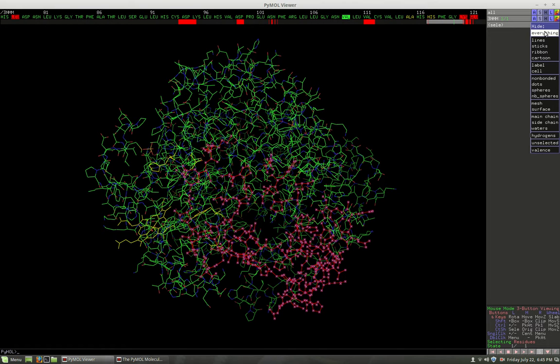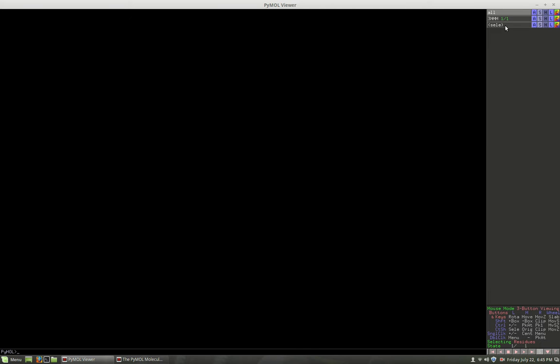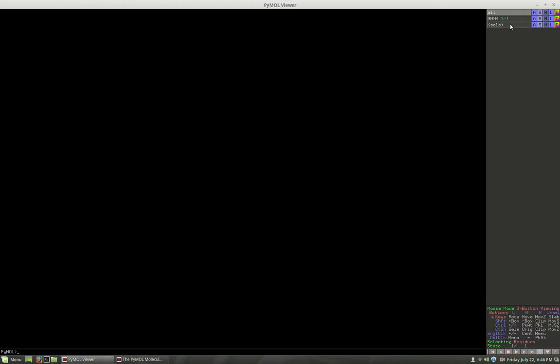Let's hide this. This is getting a little busy here. Alright, so now notice here I hit the piece that says select. The pieces I selected when I hit that disappeared. I could do the same thing here and make everything disappear, come back, make this disappear, and make this come back. These are the pieces that were chosen when I was clicking on everything or choosing everything. So that's another way to kind of compare between everything.